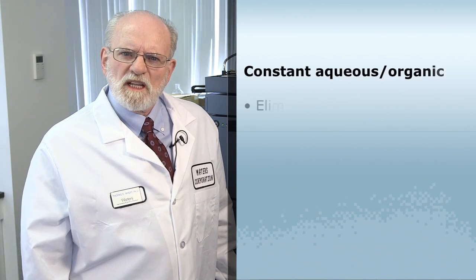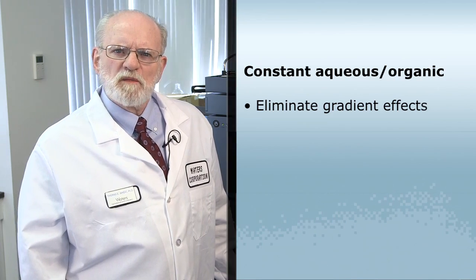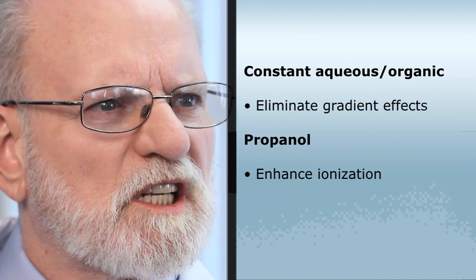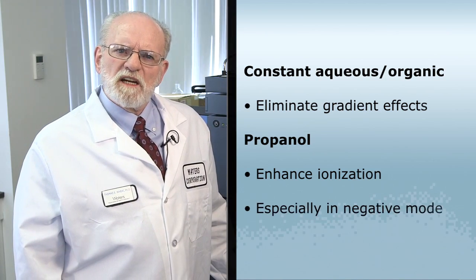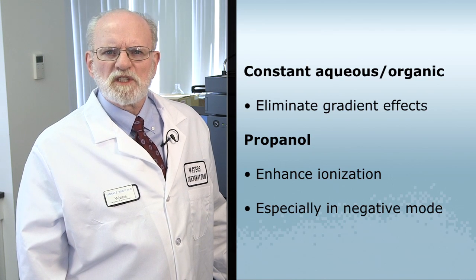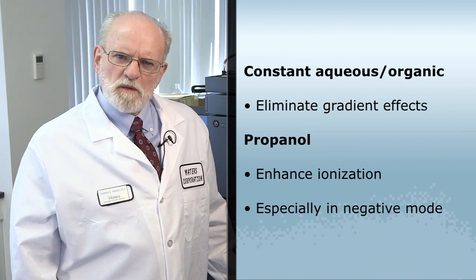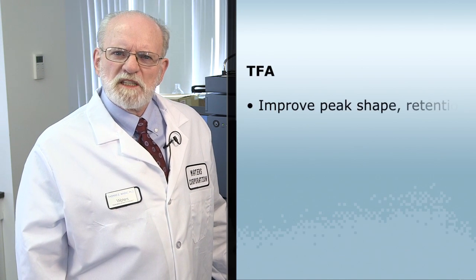For example, we can use a constant aqueous organic mixture to eliminate gradient effects on ionization efficiency. Or we can use propanol to enhance ionization efficiency, especially in the negative mode, without deleterious effects on the chromatography and viscosity.